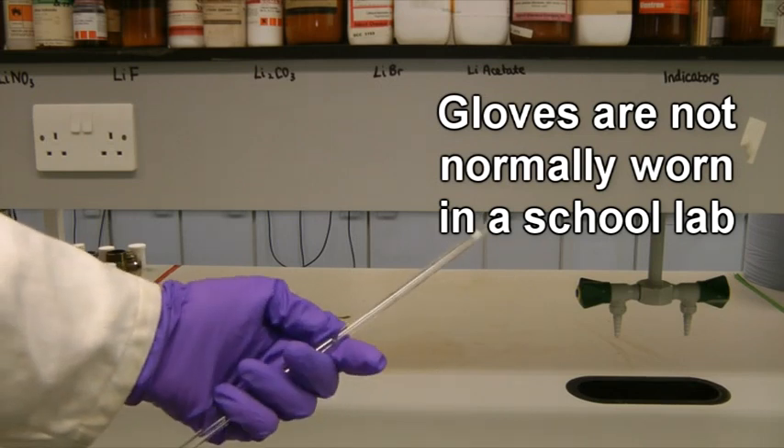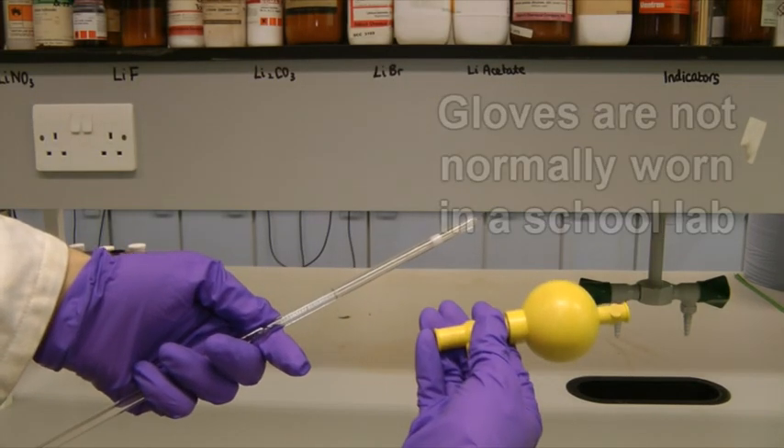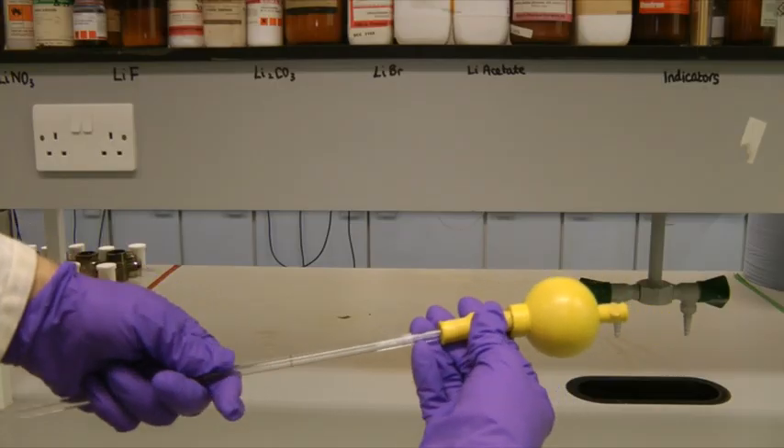To connect them together, hold the pipette horizontally just above the bulge, and slide the end of the bulb onto the top of the pipette.